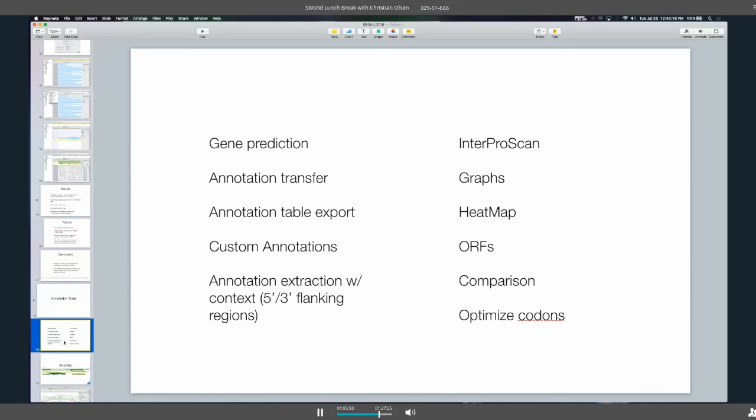We've made it very easy to export an annotation table. Okay, so once you have a list of annotations, like a SNP table, most of our users who work with NGS data, they want that SNP table. A lot of our clinical users want the SNP table. We've made it very easy to do that. We made it easy to design custom annotations, okay? And we made it easy to add your own metadata. Okay, so remember back to that falciparum workflow that we designed.